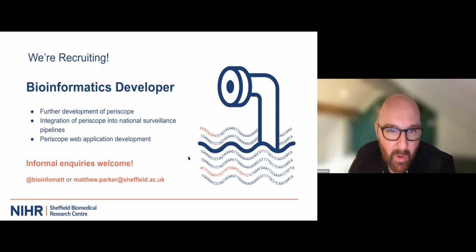And if it's B.1.1.7, for instance, we didn't really look at it before, but as I was preparing this talk and practicing, I did keep seeing this M, and a really striking increase in M in that lineage. So it's something I want to go back to and find out why that might be. But yeah, I think there probably is something in the ratio of different subgenomic RNAs, and maybe that's a measure we should start producing from Periscope, the ratios.